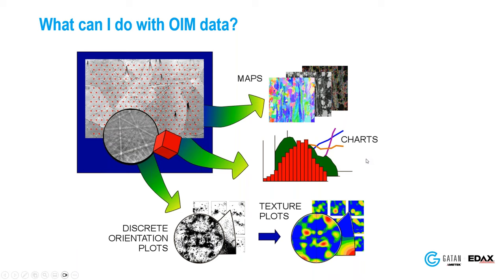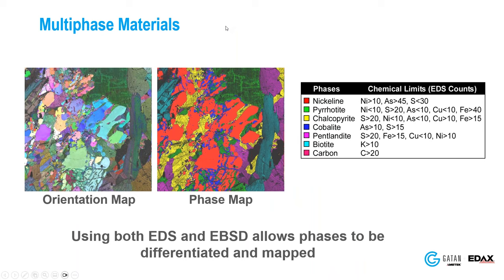Here's a map of a rock with quite a few different minerals in it. We used EDS and EBSD together to find the arrangement of phases in the material. On the right, colors represent the different phases — seven different phases total. On the left, we see the orientation, with each phase having a different color triangle.